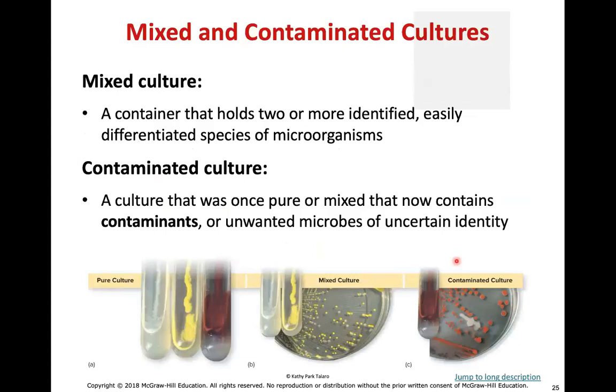One thing in microbiology is that when you are culturing, contamination is something you will have to deal with. As I mentioned, microorganisms can be present in the air. They can be present on any surfaces, so contamination could be a real thing. And even the best microbiologist will end up with contamination. So it's nothing that you should necessarily think that you did something wrong, but it's something that you want to try to minimize as much as possible.